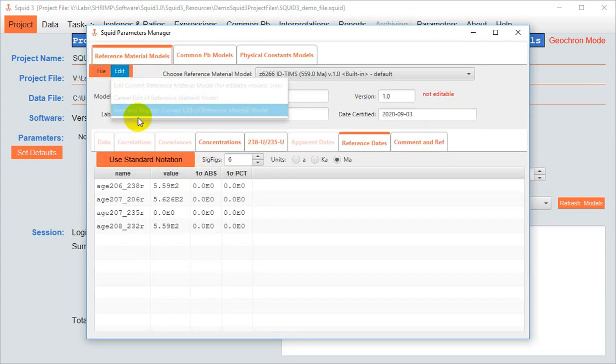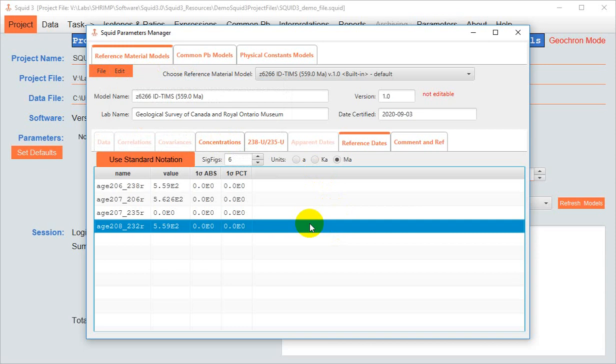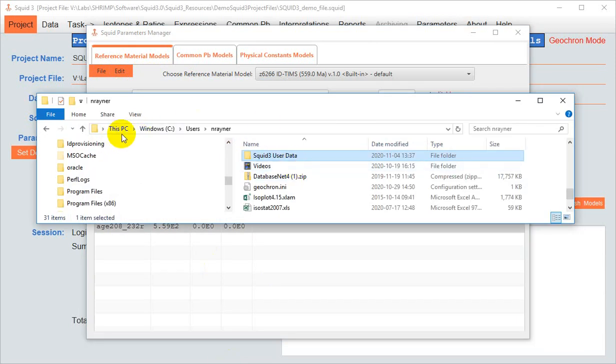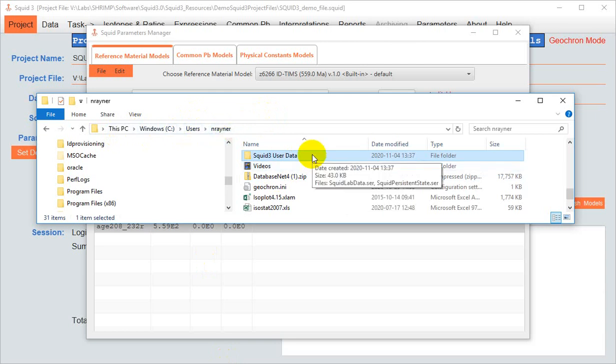When you save and register a model, it's now available to you for future use. However, it's only available to you on the computer where you made the model, because it's written to a .ser file, and that file is saved on your local C drive, in a subfolder under users, and the user's name, called SQUID3 user data. You have no choice in this matter. This is where it goes.